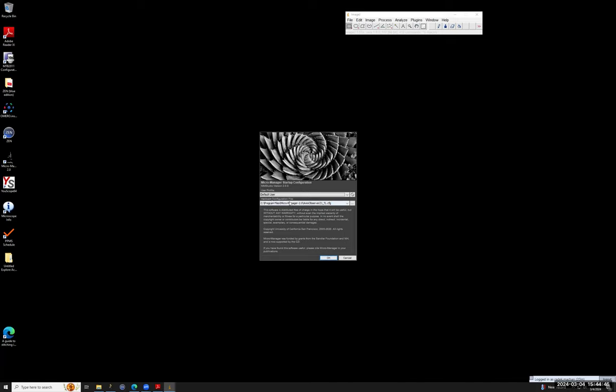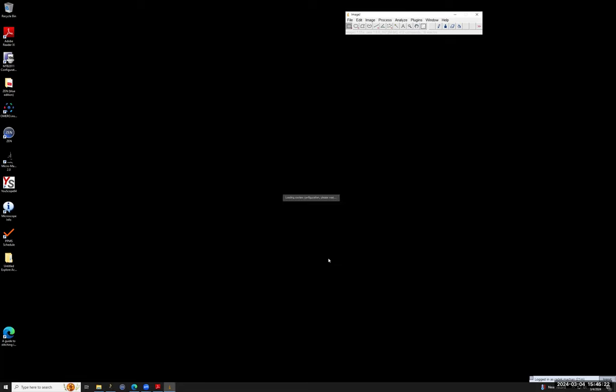Maybe this might be hard for you to see because the letters are quite small, but here is a drop-down menu where you can select from different hardware configuration files. So you can have multiple hardware configuration files, and I will in a while explain more about that. So I will load one of them. It will always offer you first the last used hardware configuration file. I press OK.